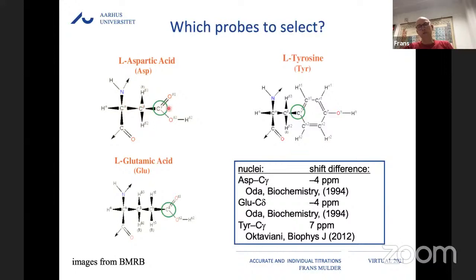I think that you can definitely look at small enzyme systems of 30, 40 kilodaltons, that would not be a problem at all. Of course, one has to do the assignment. One has to find out in the NMR spectrum where each probe is located. But I guess the approaches that have been developed for looking at larger proteins by NMR spectroscopy, by deuteration and carbon observation, allow more complex systems to be looked at. And I know that Fleming Hansen at UCL is also doing that.